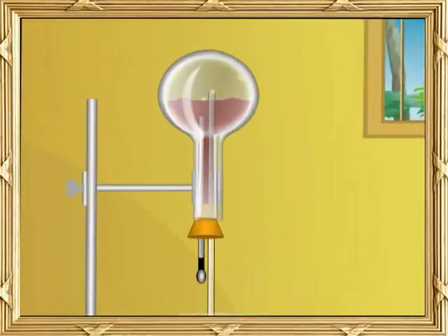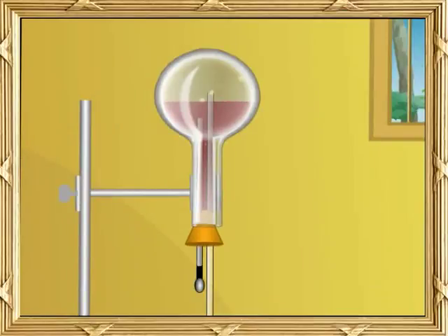Water from the ink filler dissolves the sulphur dioxide to form sulphurous acid. This creates a vacuum in the flask. Blue litmus solution enters through the jet tube. Sulphurous acid in the flask turns blue litmus solution red.